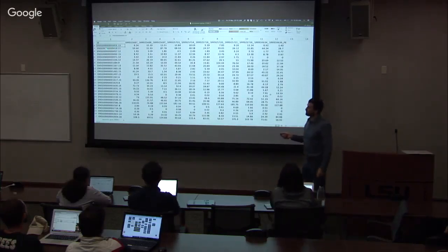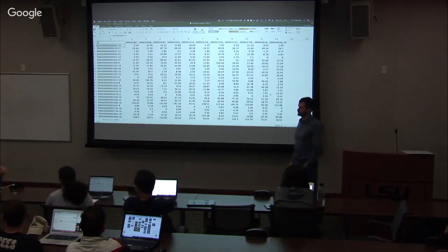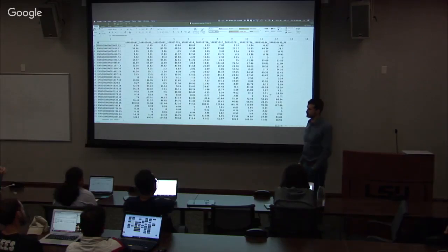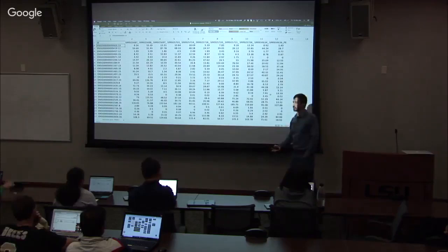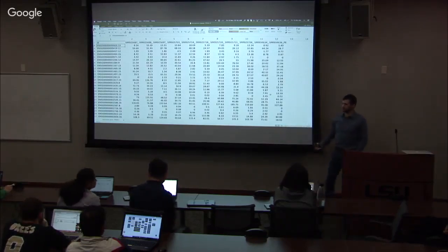Okay, so, and I apologize, I'm catching up with some of the live stream questions. How do you know which GTF file to use since there are so many on NCBI and other places? So each assembly, for example, we're using the human genome, will come with its updated GTF file.